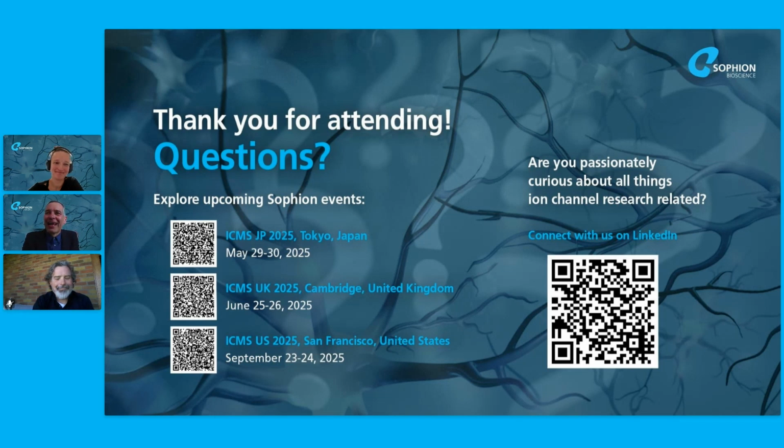Okay, moving on. Iliada asks, do these neurons have spontaneous action potentials? And I guess that could be to both of you, because Scott, you will have done some of this with your MEA recordings too. Yeah, I can quickly answer for the dissociated neurons that we work with. In general, they don't. Not necessarily because they wouldn't do it in a network, but I think this whole dissociation process is affecting them somehow. And we do see it rarely, but in general, not.